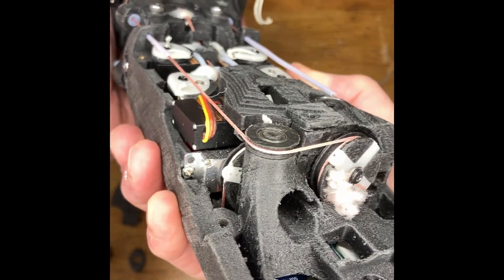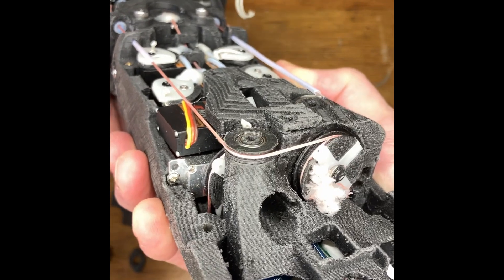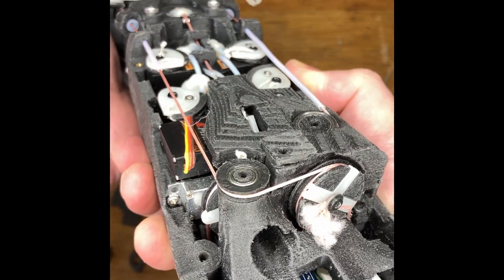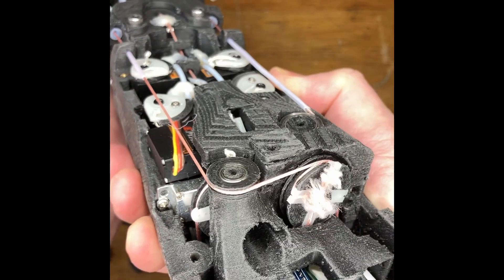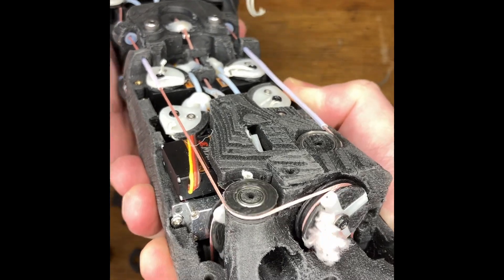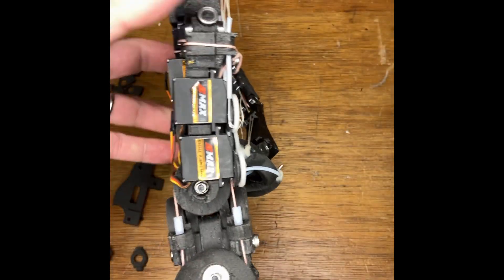There are two wrist motors and they link the diagonal corners of the wrist, so by driving them differentially or together you can produce all the rotations of the wrist.